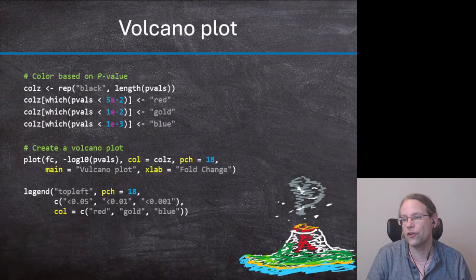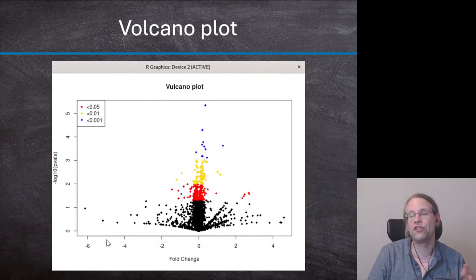Good. All right, so volcano plot, I put in a picture. So this is how it looks.